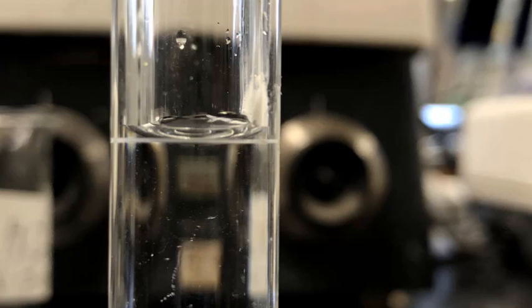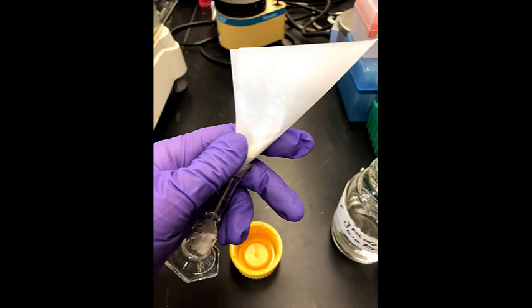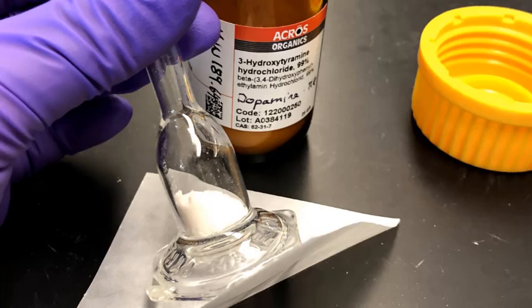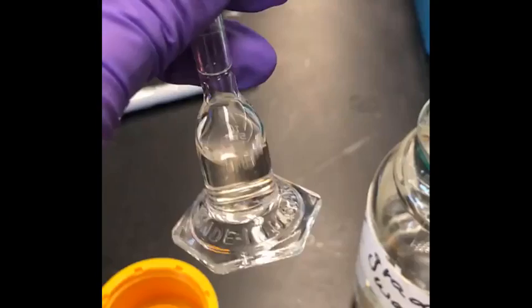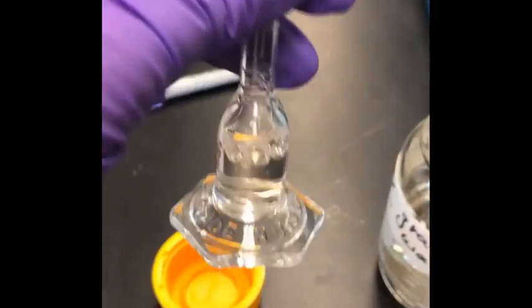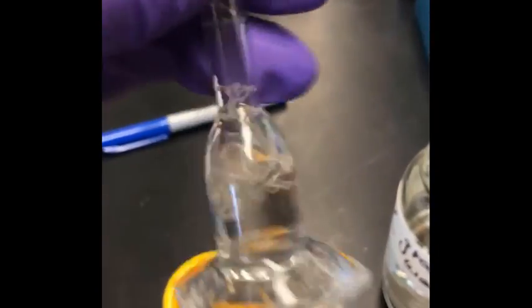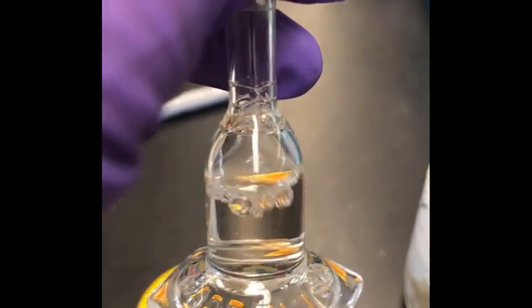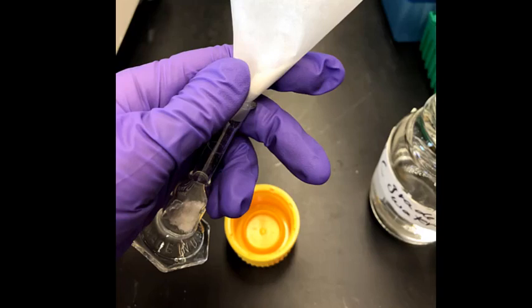The next alternative is to transfer the solid powder directly into a volumetric flask. In this example, it's a smaller volumetric flask, but then all the mixing needs to happen inside the volumetric flask. There is less glassware involved, so more quantitative transfer, but it's less convenient to dissolve the powder, and it's more difficult to get the powder into the narrow neck of the volumetric flask instead of the beaker.